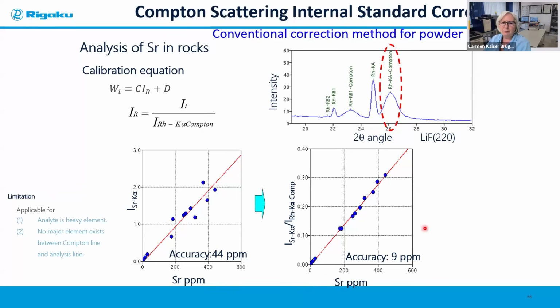Of course, because there's a good fit and there's a correction, we get a good accuracy on this method. So usually we try to choose this method only with very heavy elements. It's applicable to the heavier elements and not light elements. And it's very useful for this.